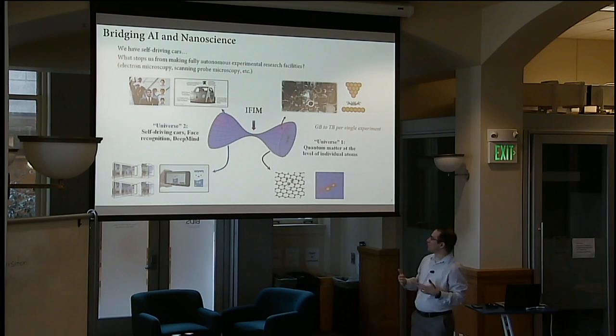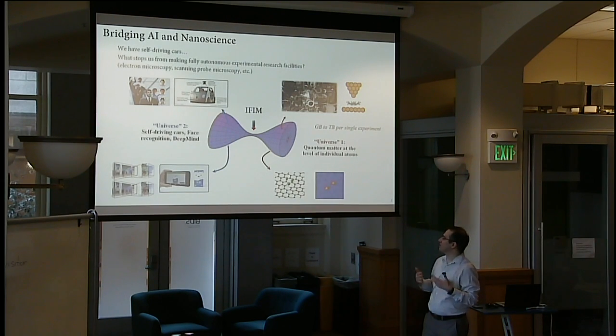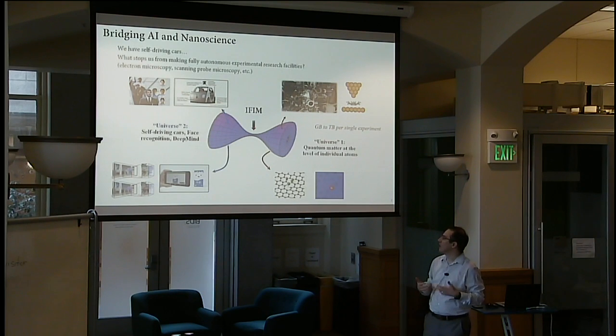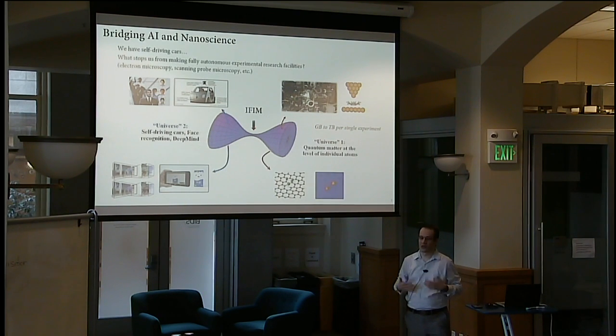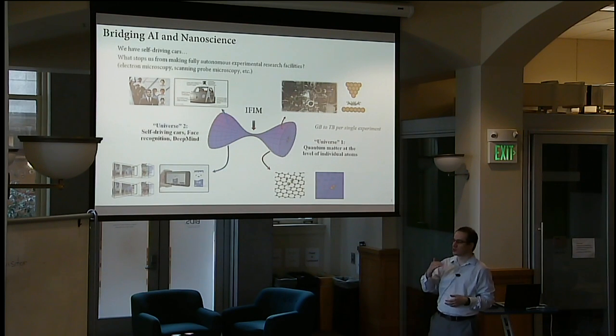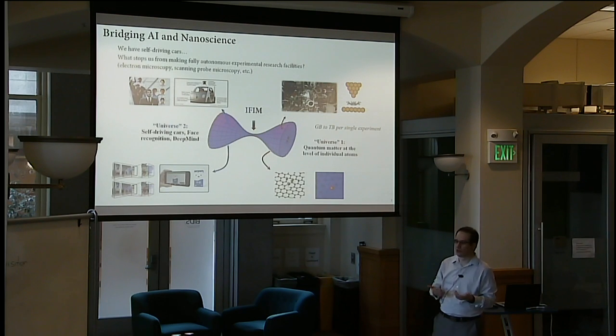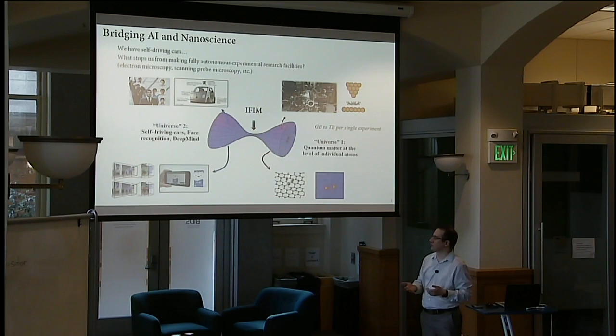And here we try to understand how materials behave, physical and chemical processes at the atomic level, and to use this knowledge to learn how to control them in order to enable atom-by-atom fabrication of materials with desired functionalities, which is the ultimate goal of nanotechnology.